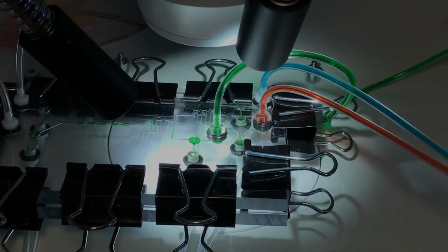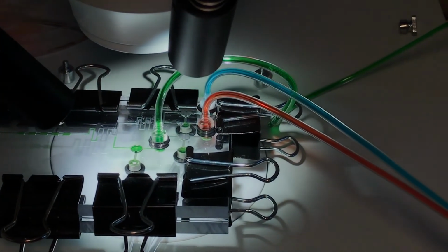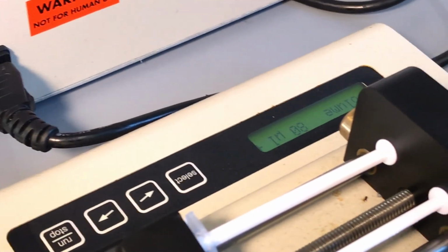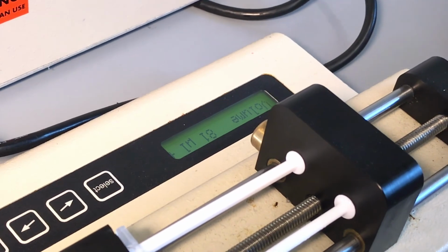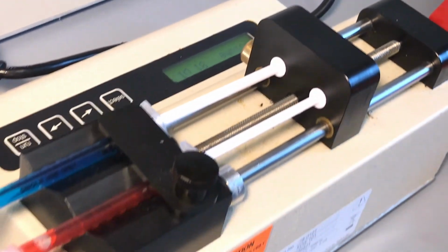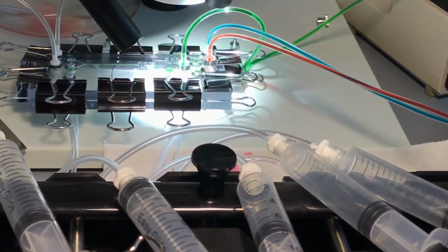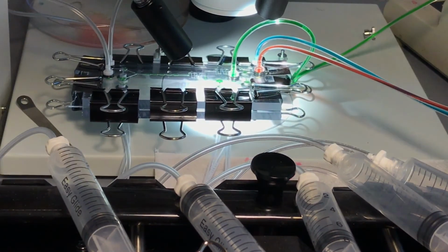This is followed by the 3 inputs seen here, using basic dyes to test fluid flow, control, and mixing. The overall flow rate is set by this dispenser, both set to a standard rate around 1.5 milliliters per hour for this case. The 2 outputs for this device on the left are open to dispense into a waste container directly.